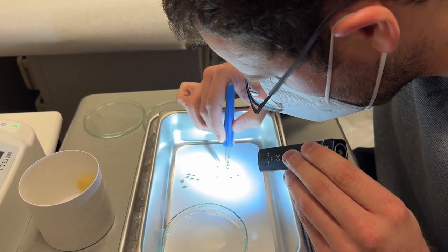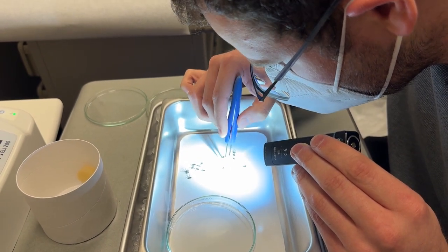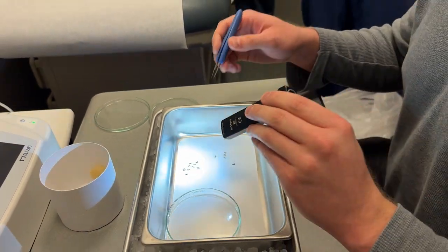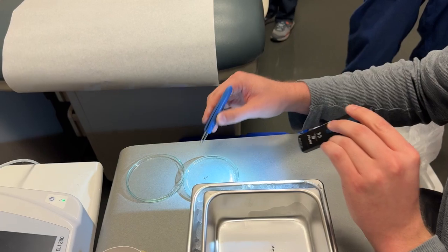Eight, nine — that's 10 mosquitoes. The ones who are unfed are going to go into a cup containing 70% ethanol.